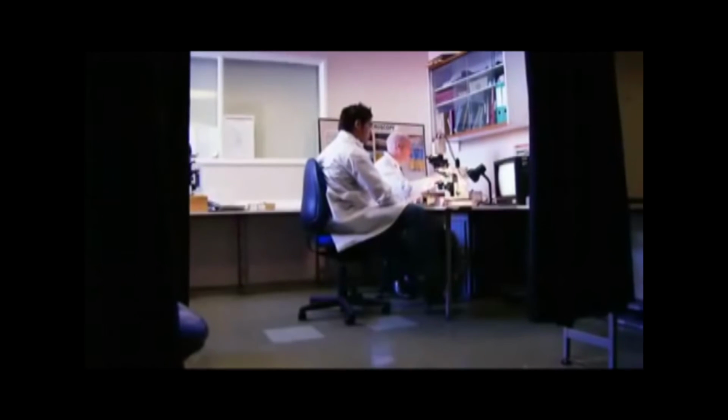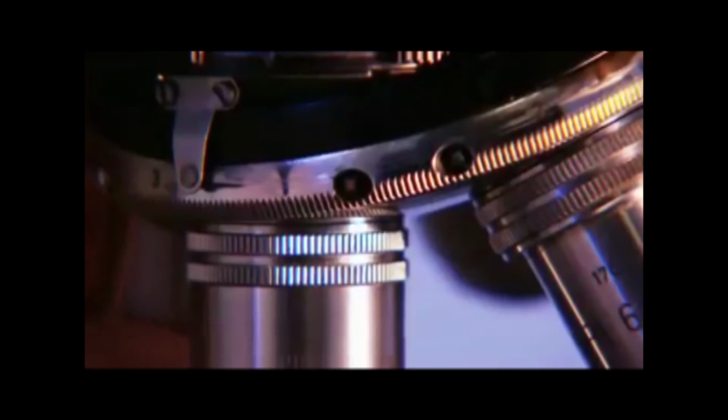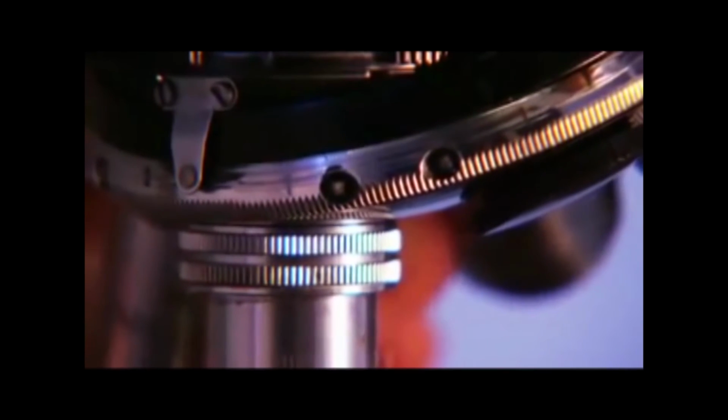Peter Grant is an expert in hair and fibre analysis. The first step is to look at our evidence under a microscope. Fibres look very distinctive when magnified, so identifying different types is straightforward. Naturally occurring vegetable fibres like cotton look flat and twisted. Animal fibres such as wool appear scaly, while synthetics look smooth and speckled.